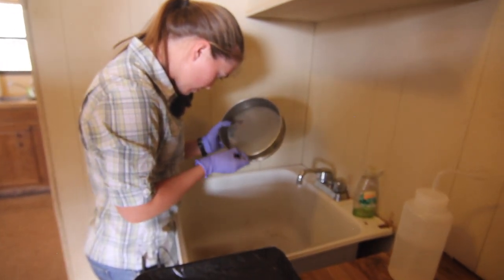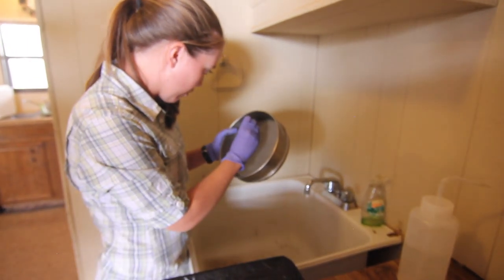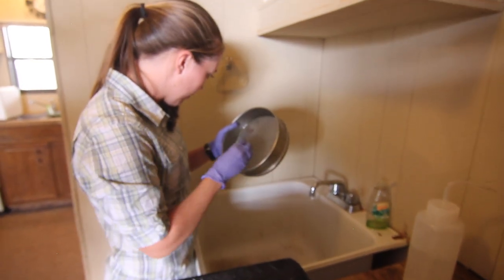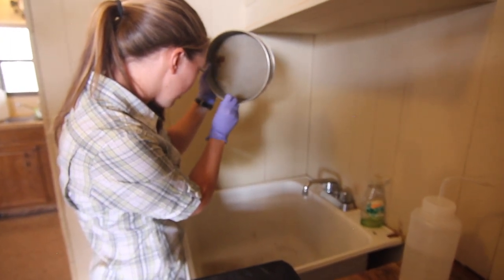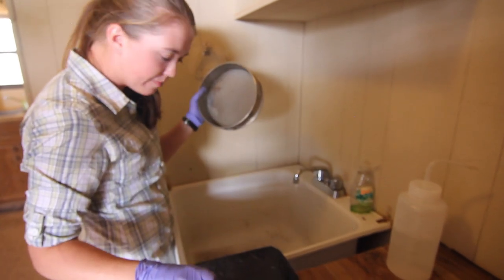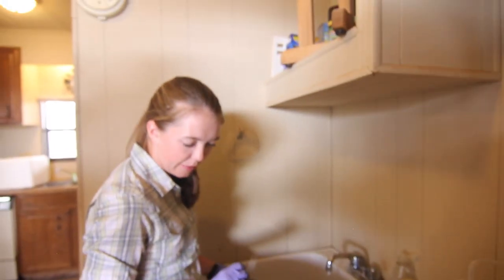Quite a bit more tedious work than the eye worm, isn't it? Definitely. More worms. Usually they're typically smaller than the eye worms. And the sieve will just grab onto the worms and make it hard to pick them off. But I think I've got them all. And so now I'm going to take it back to the table and count them.